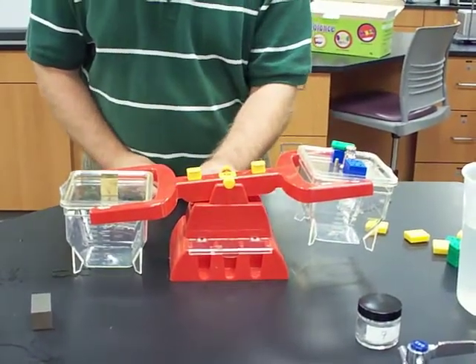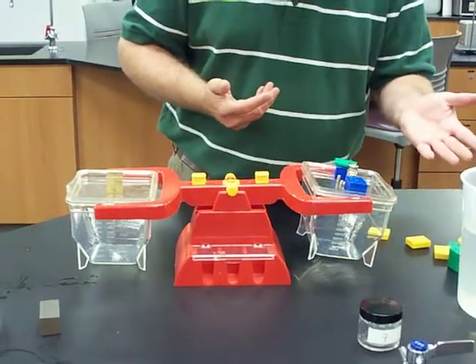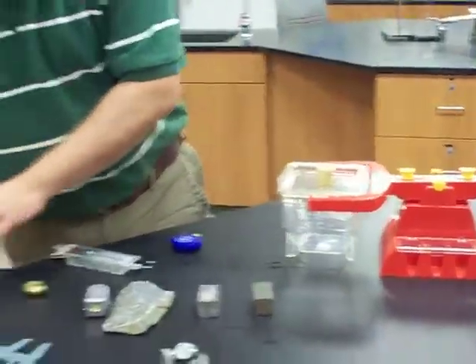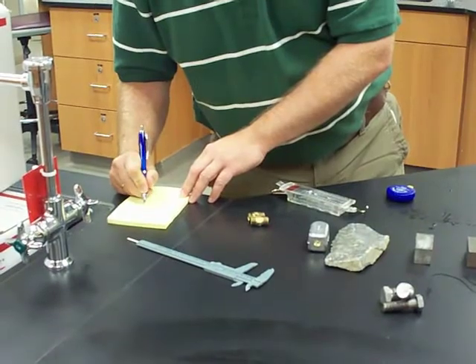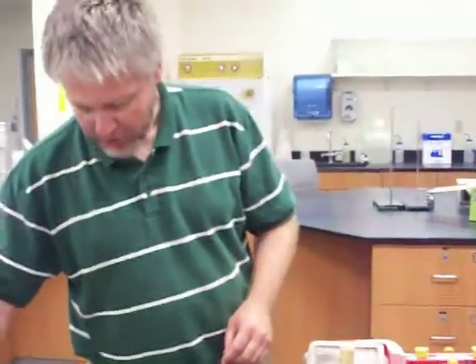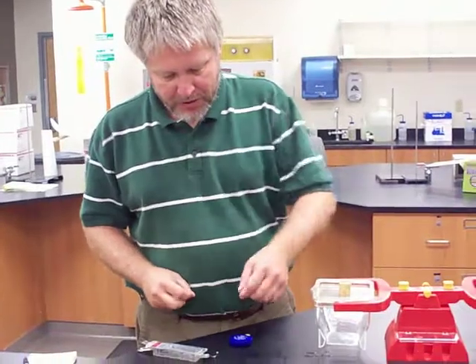Boy, that's really pushing it here. 139 grams, and with an error of plus minus 0.5 grams because I cannot measure any more accurately. Okay, and then I'm going to do the calculations for the density later.